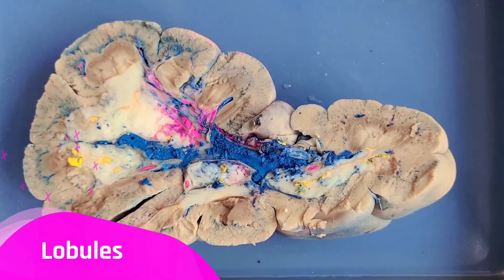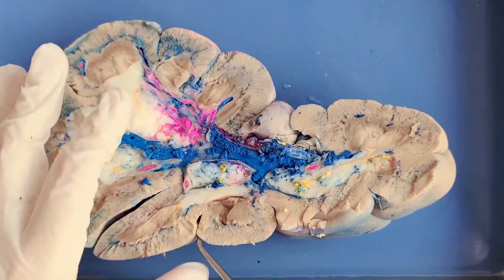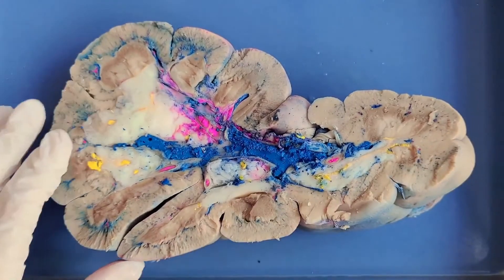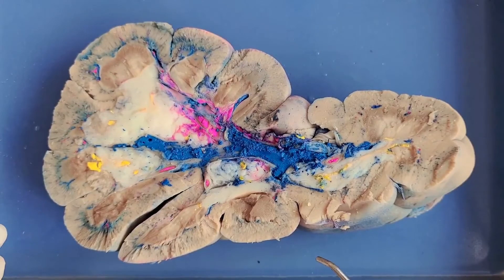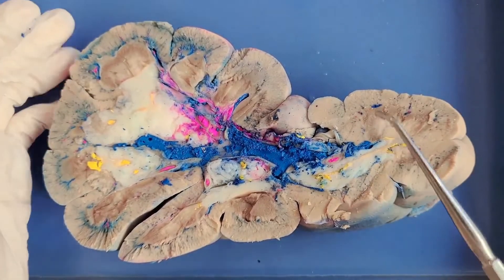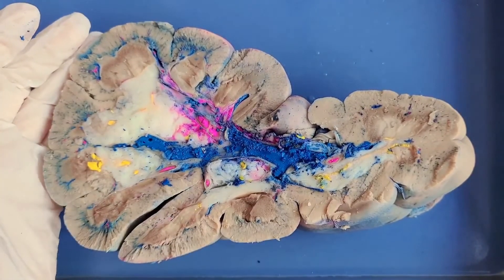You can now see the lobules dividing the cow kidney. Here is a lobule right here, and there is another one. Fun fact: in developing human fetuses, the kidneys are also similarly lobed — our lobes just all merge into one another to form a smooth bean later on. This outer beige layer all along the kidney is called the cortex. I'll put a pin here to mark the area.